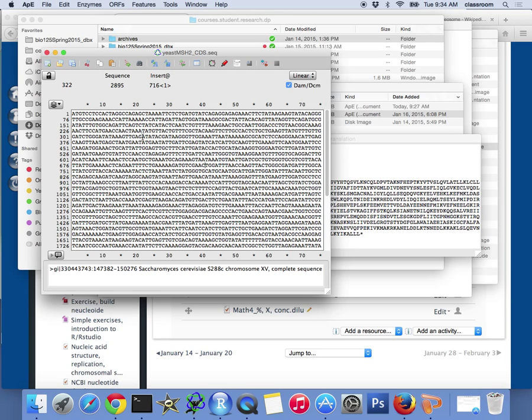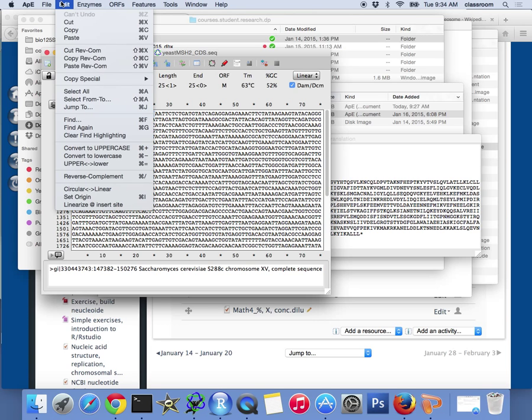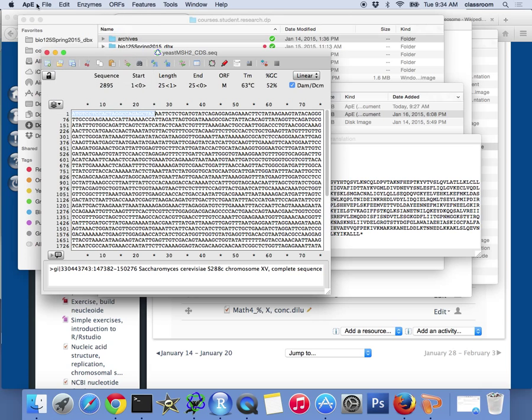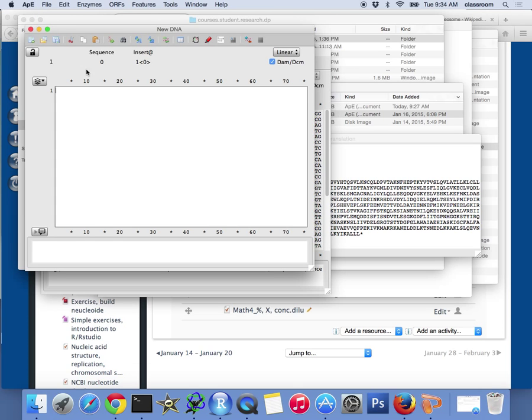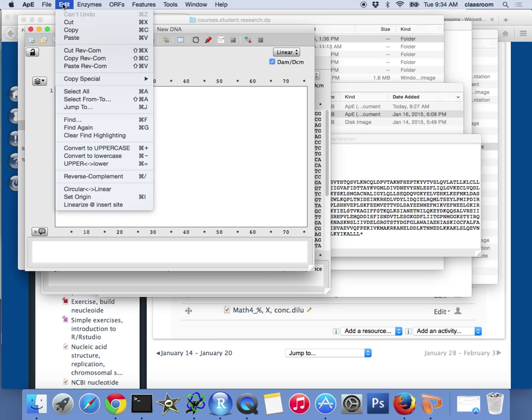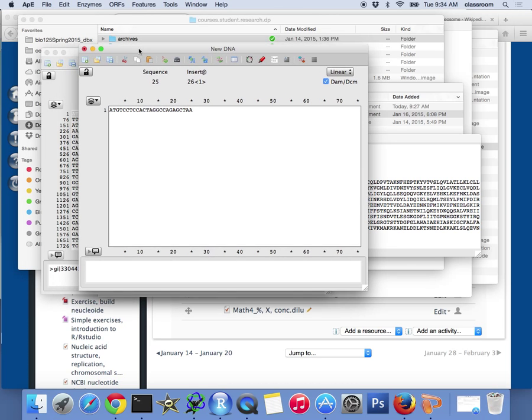I'm going to show you how to find the reverse complement strand of a DNA sequence. For simplicity, let's do a very short piece, about 30 nucleotides. I'll copy this, using Command-C on Apple. Then I'll say File, New, and paste this.